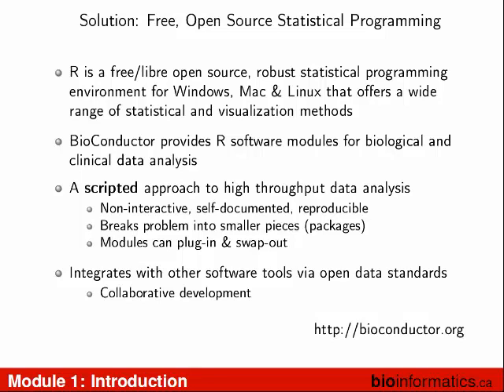And when something goes wrong, you have that described in front of you. There's no mouse menus that you have to remember where to click. You describe in code what you have to do. So it's self-documenting what's happened.